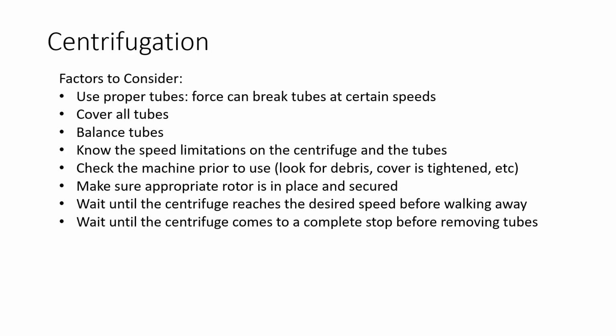If that glove had been in there, that would burn up the centrifuge, and centrifuges cost quite a bit of money, so you want to make sure that that doesn't happen. It could also invalidate the patient specimens and cause for recollection of all those patient specimens. So you want to make sure that all debris are clear, that no dust or dirt or anything like that flew into the centrifuge before using it.